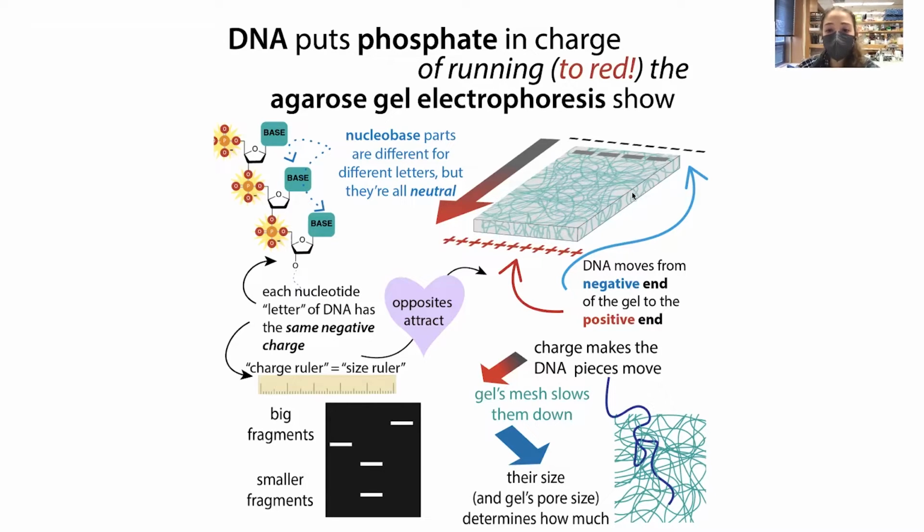And why it's so useful for this is because you can make this gel mesh, where you have an infinite network of various polymers. A polymer is a long chain of repeating similar subunits. So with a mesh, you have this infinite network of polymers, and it is holding some sort of liquid, in this case water. And what's really cool is that this allows us to send our DNA swimming through that liquid.